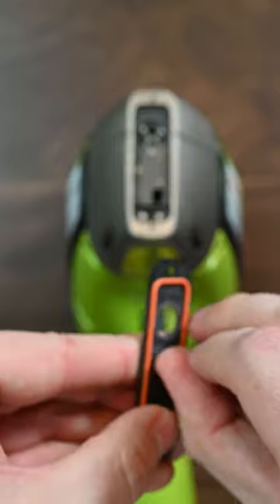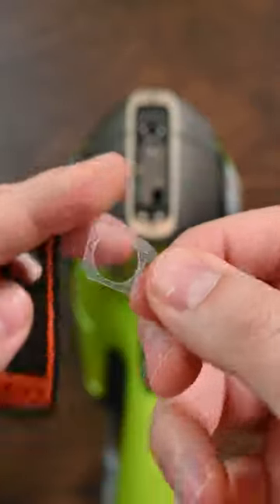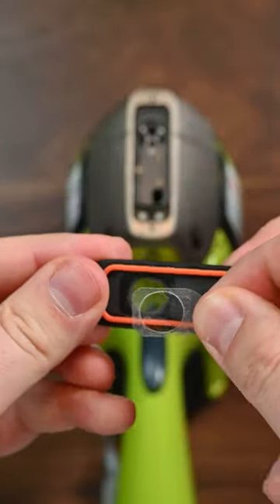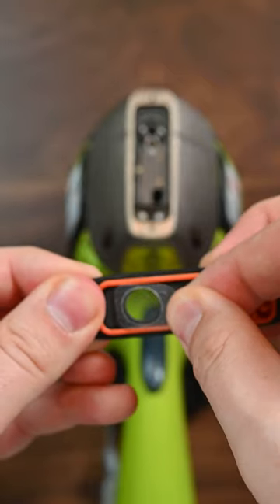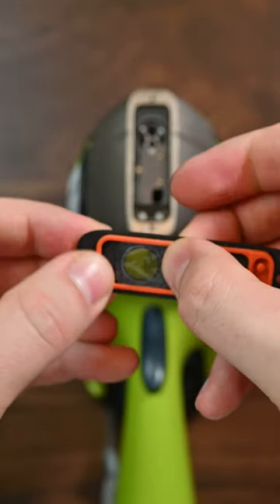The window is right here. I'm going to grab this tab and pull the window off. Then I'm going to take the new window and align it with this hole — just like this — and press the window down.